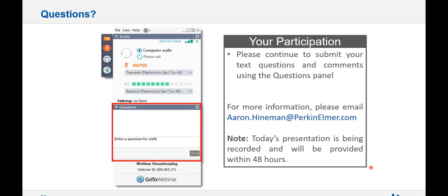I have a question. Someone said, I can't get a good blank value for zinc on furnace. Well, zinc's always a tough one, right? In any atomic spectroscopy technique, it's easily contaminated. Usually it's one of the reagents or something like that that has some background zinc.